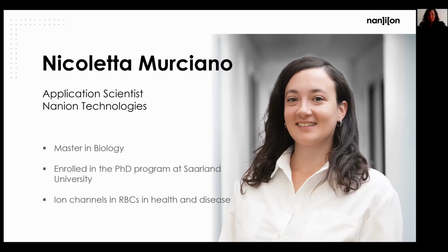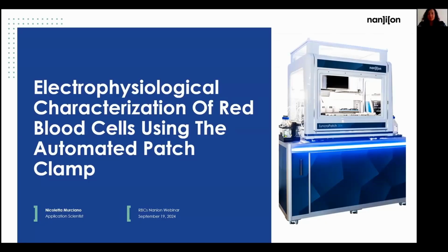Thank you, Artem, for this nice introduction. Today, I'm going to talk about the electrophysiological characterization of red blood cells using the automated patch clamp.